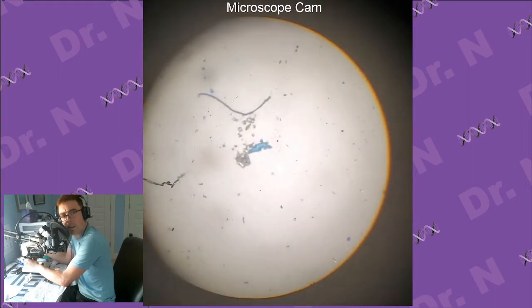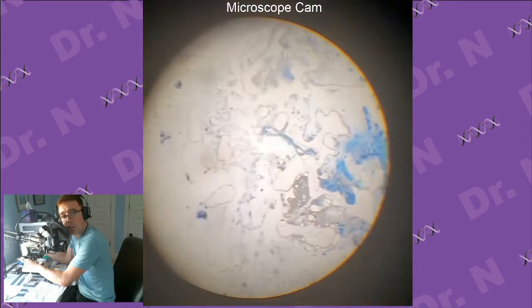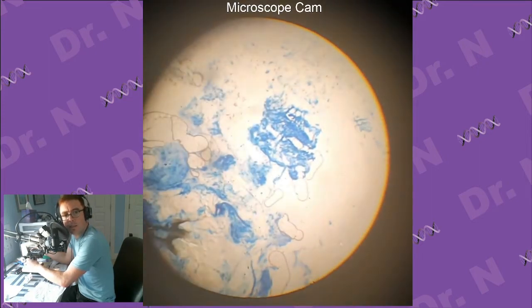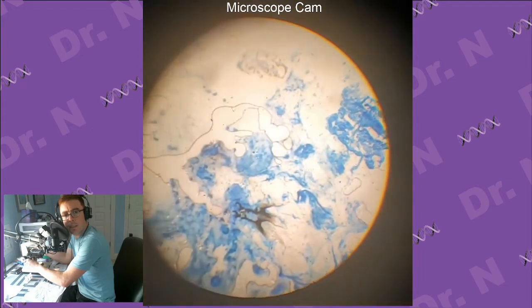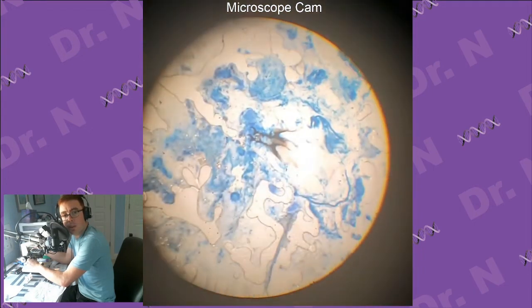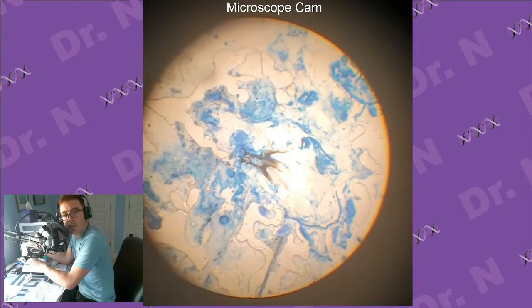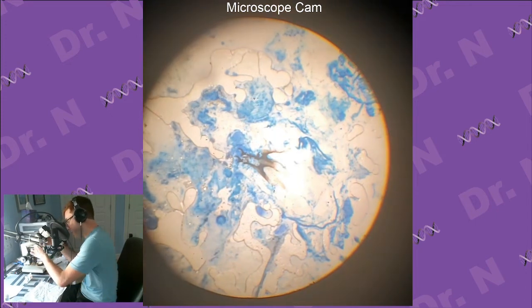Huh. I guess I really... Oh, there they are. Okay. That's what I was looking for. So not much. Oh, actually a really good look at those mouth hooks. So the mouth parts. Okay, so I'm just gonna zoom in and we'll see what we can see.